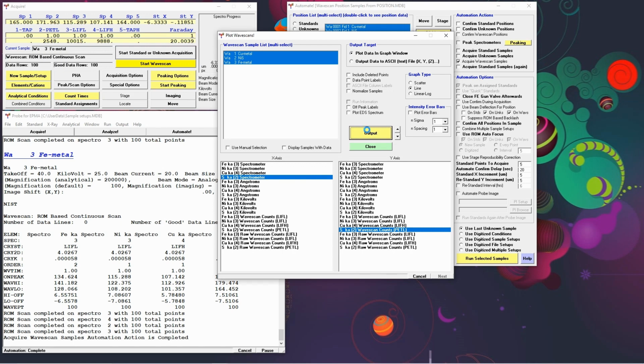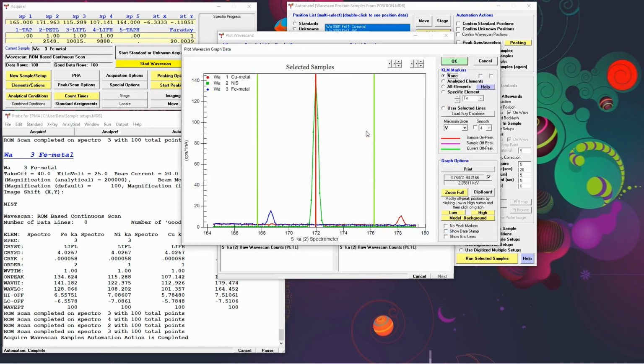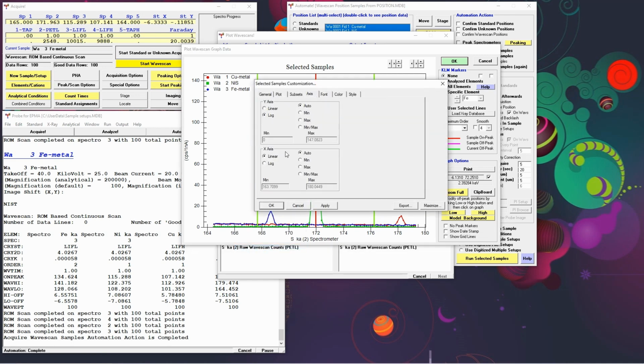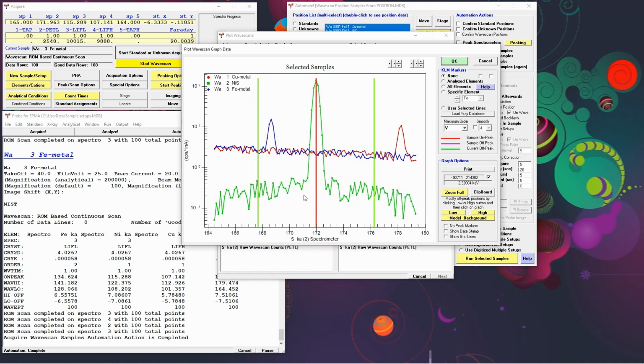And finally look at sulfur. And again there's a potential problem with the background. We check analysed elements, and that looks like an iron K beta 3. Again, let's just check with the log scale. And I'd say we need to move that low background as well. Let's move it out there.